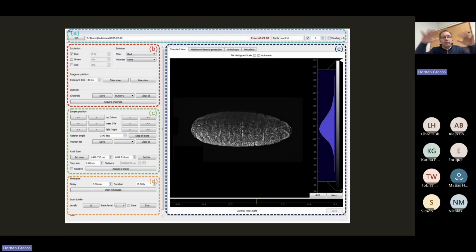So it orchestrates all sorts of devices: a camera, the lasers, the light blockers, the stage to move the sample, to rotate the sample, and so on and so forth. And so this shows a little bit the power that you can build in your own tools from scratch. And the good thing is that now you don't need to build everything from scratch, because all that information is open source, and therefore you can get that tool that I have built and develop your own.